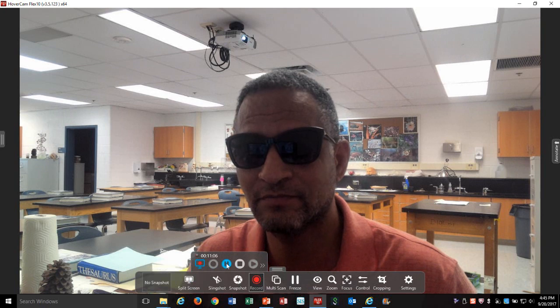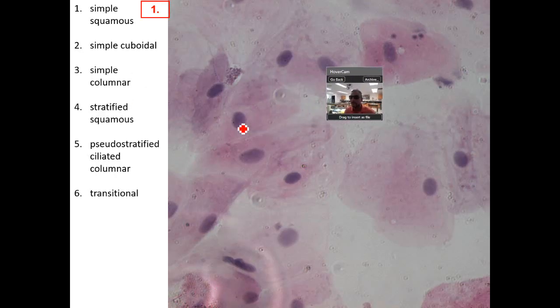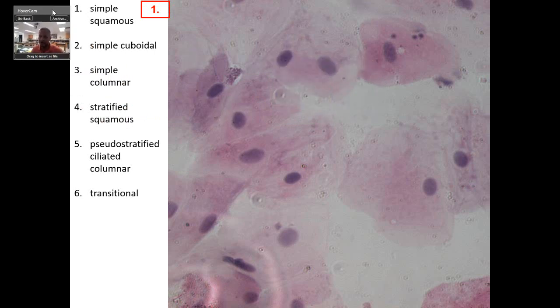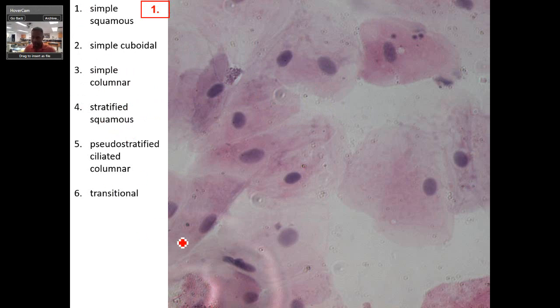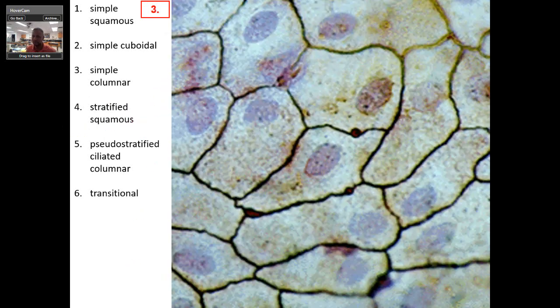Okay. This time I'm going to throw myself out of the way. Here's your list of answers. By the way, if you're one of my students, you will not have a word bank. This should be simple squamous right here. Next one — take a second. Stratified squamous. They're flat cells, one layer — simple squamous.